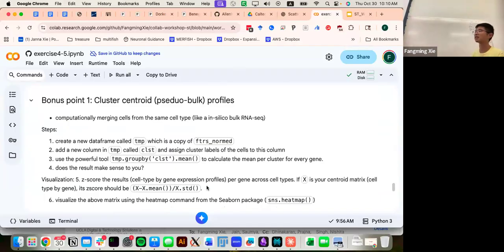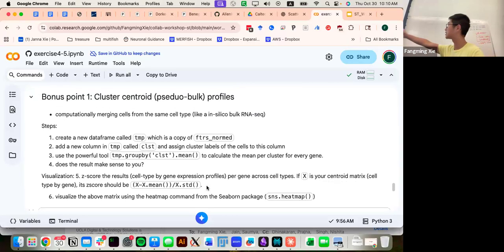You generated 20 clusters. Your task is now to get the centroid profile for those 20 clusters with no template. But I did provide you with a step-by-step guide for how I would do it. It may or may not be useful to you, but you could figure it out yourself in whatever way.